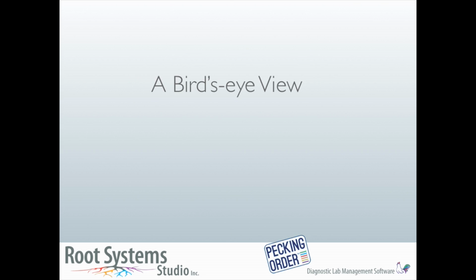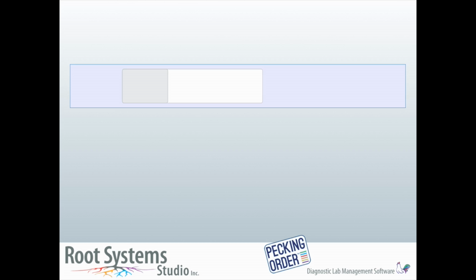Pecking Order is a web-based collaborative production tool to help manage diagnostic lab services in the poultry industry. This is a quick orientation of how it works ahead of an in-depth demonstration. Here are the basics. This is what a case looks like.